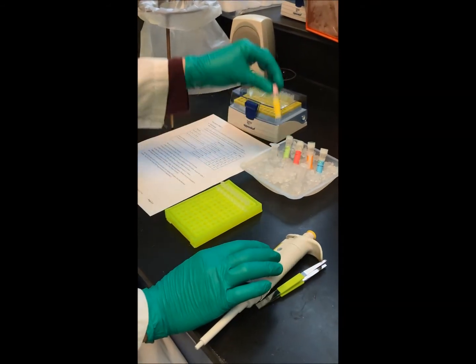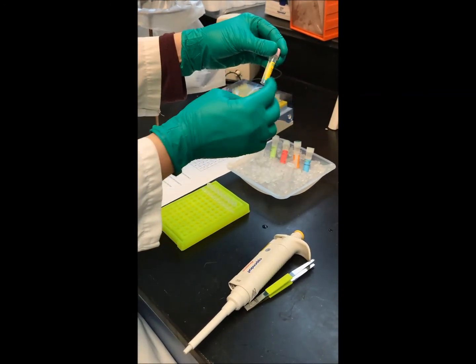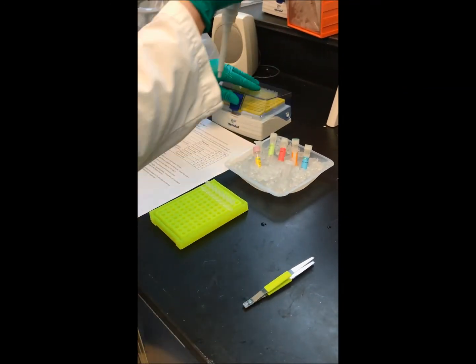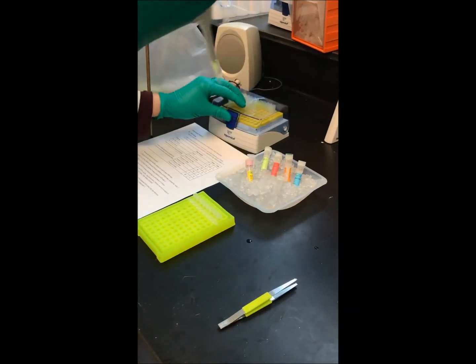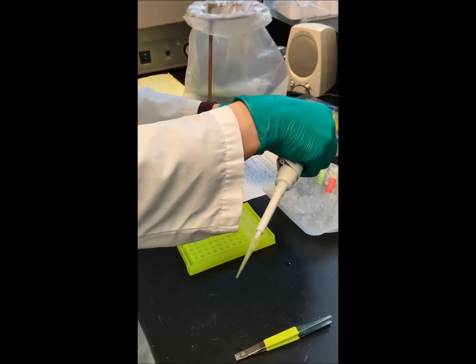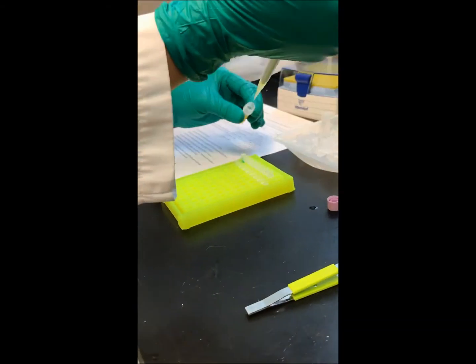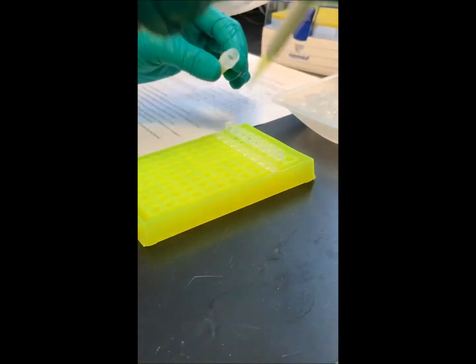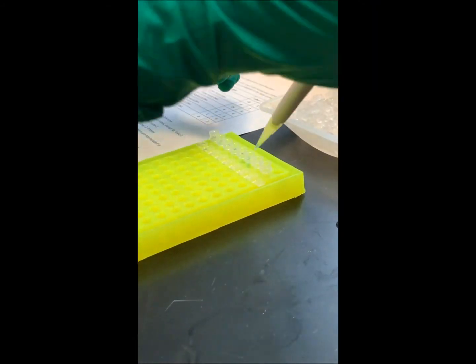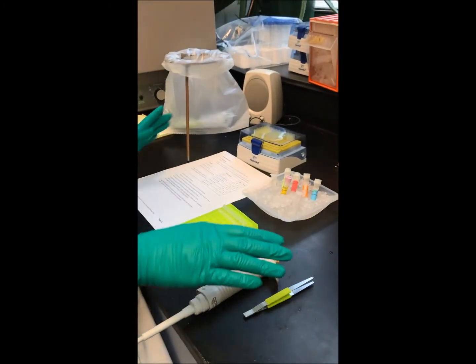I'm ready to add the master mix, and very conveniently the master mix, which contains everything, is colored, so now I know I've added it to all my tubes. So for this I just need to add 20 microliters. It's a pre-mix. It's very easy. So I'm going to add it, and essentially I'm ready to go.